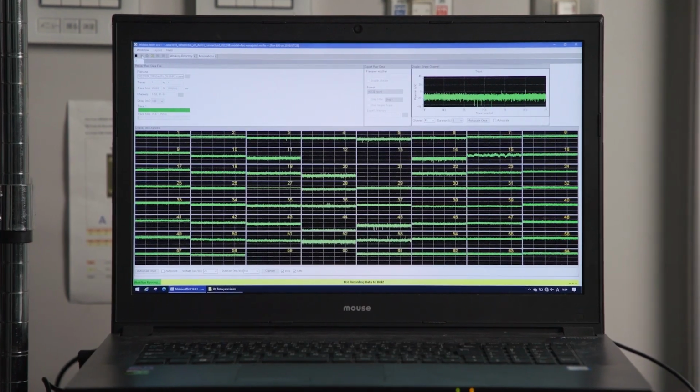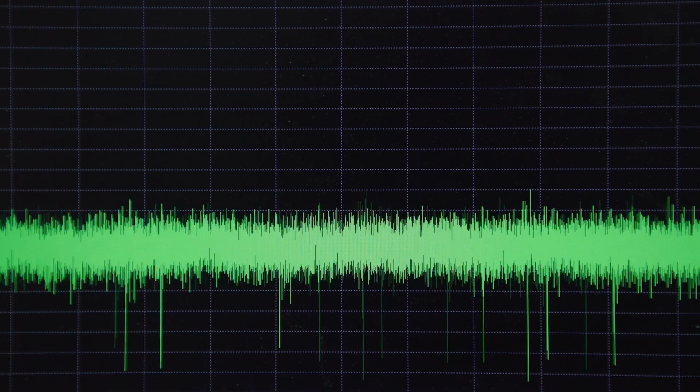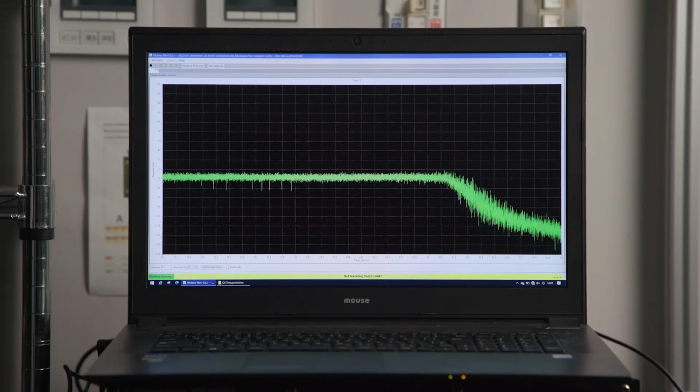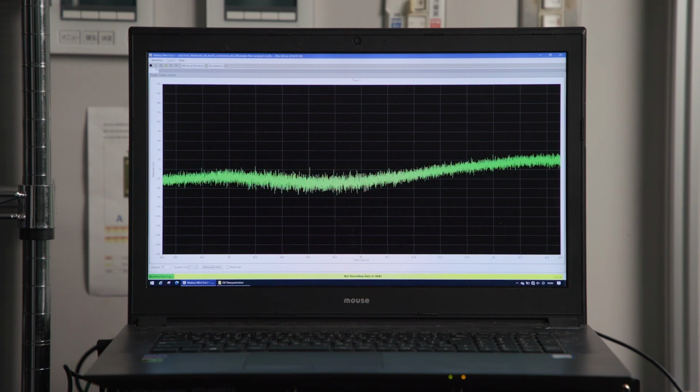Neuron clusters react to stimulation in particular ways. For example, isolated spikes, which represent transient electric signals generated by excitation of neurons, and bursts, which are a group of spikes in a small time duration, are translated into sounds and animated graphics.